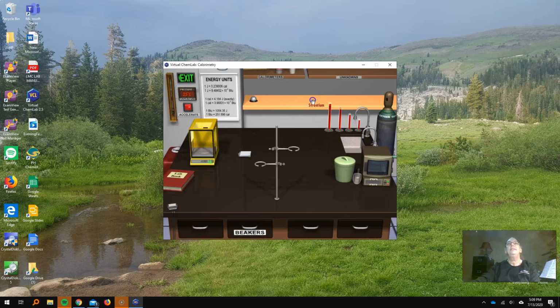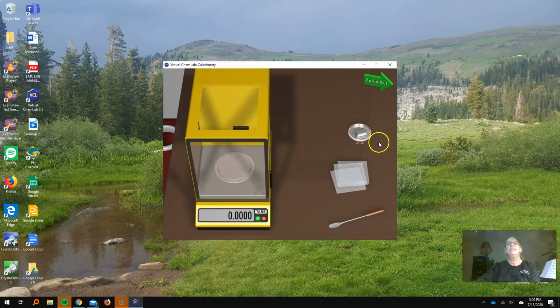Return to lab. Here we go. Let's check our balance. Good, 0. Strontium here. Put this mass for strontium, Sr, and then you're going to figure out the molar mass, the moles of each element, and then the atoms of each element. Okay, so that's part 1.